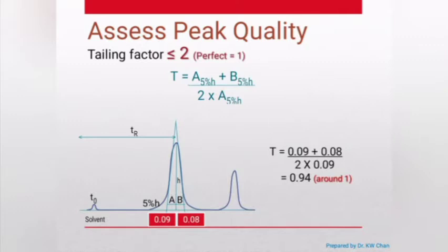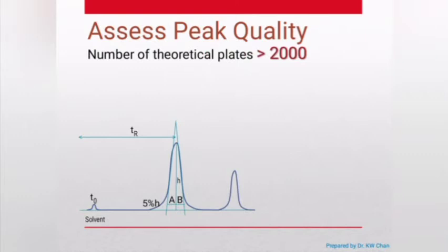For chromatographic techniques, it is advisable to know the number of theoretical plates, which is the N value. Traditionally, the threshold is 2000. For this N value, the more the merrier. A high N value means high separation efficiency. Good efficiency usually records 4000, 6000, or even more.